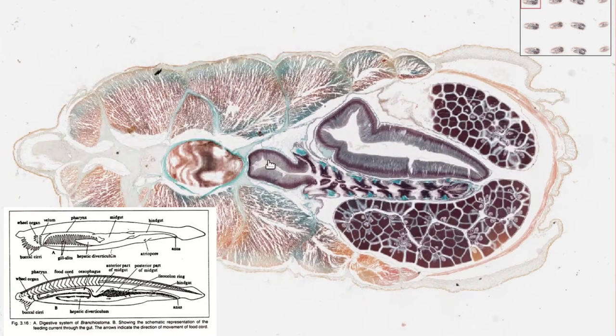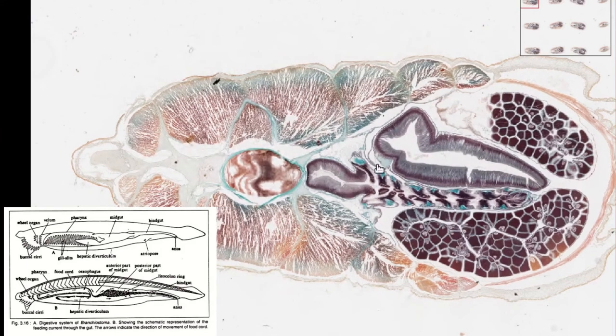So here, this is also a cranial section, but perhaps it's a little further back. The hepatic diverticulum is a little bit wider. And that's the only clue, really, that it's from more caudally.